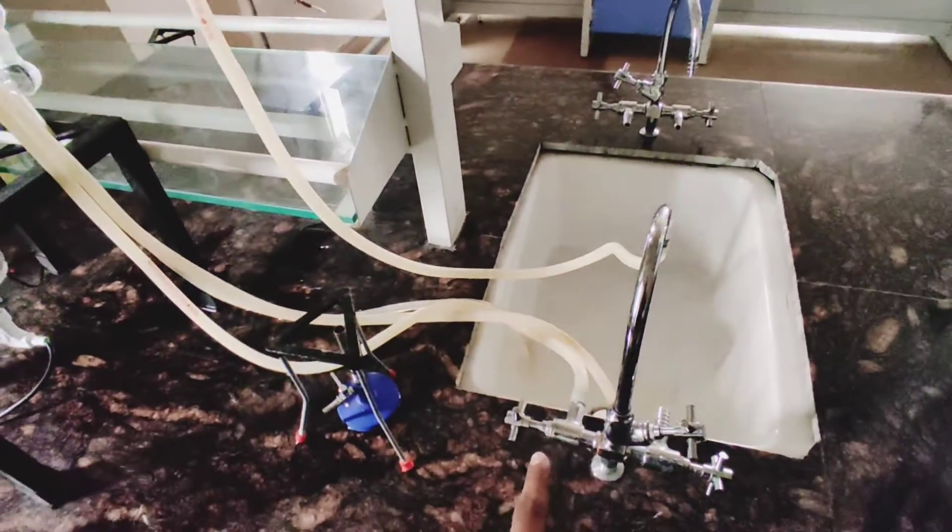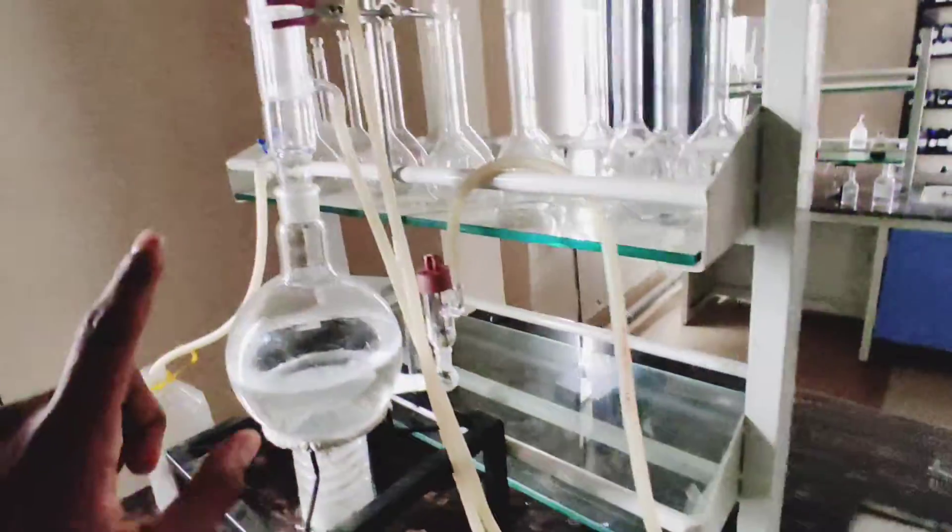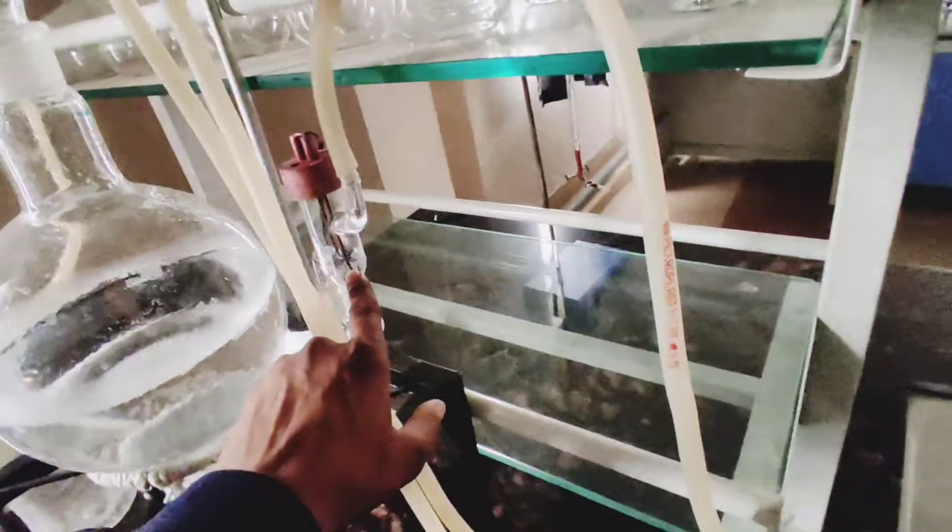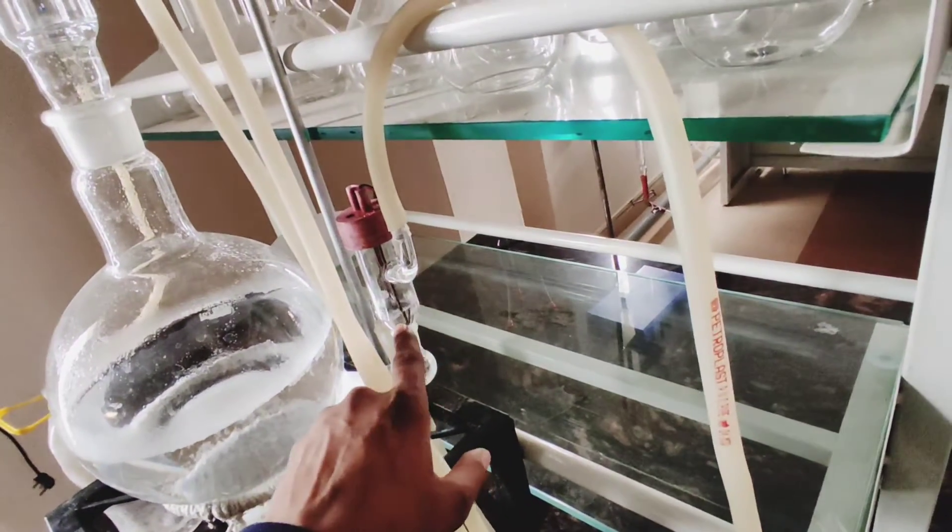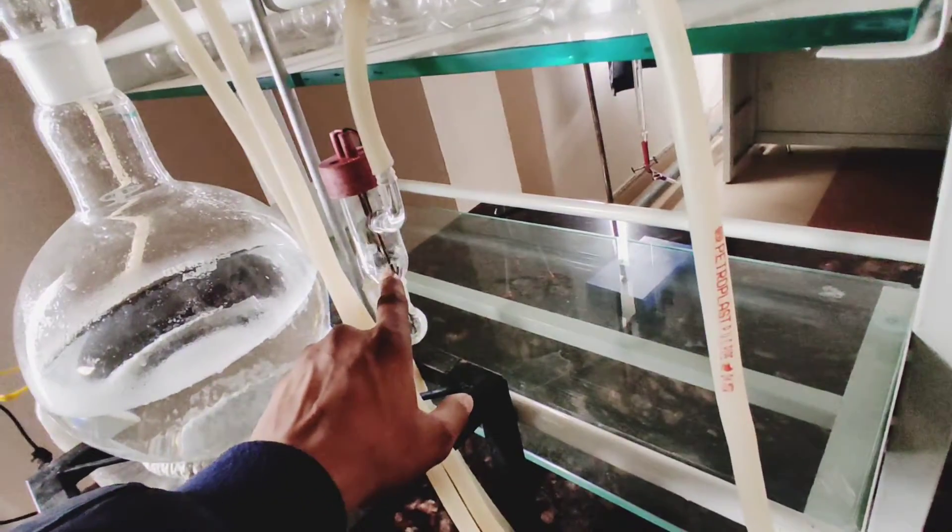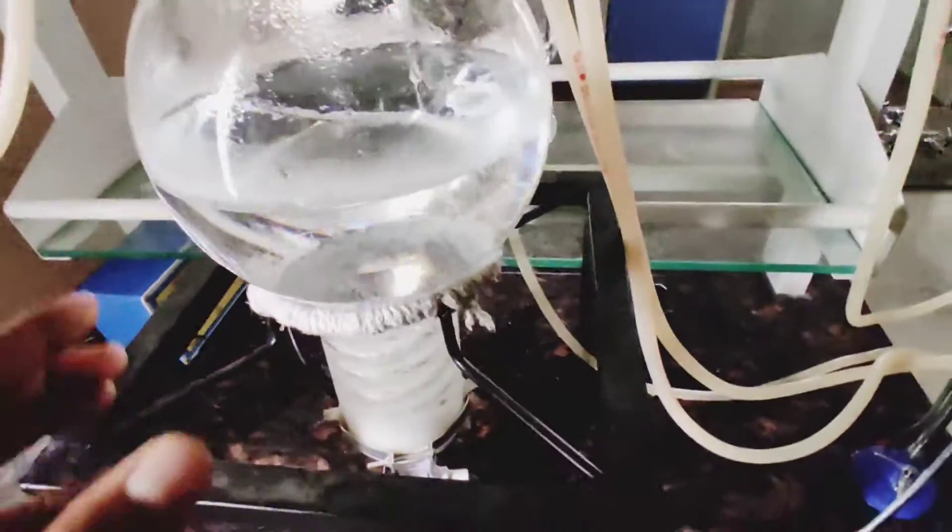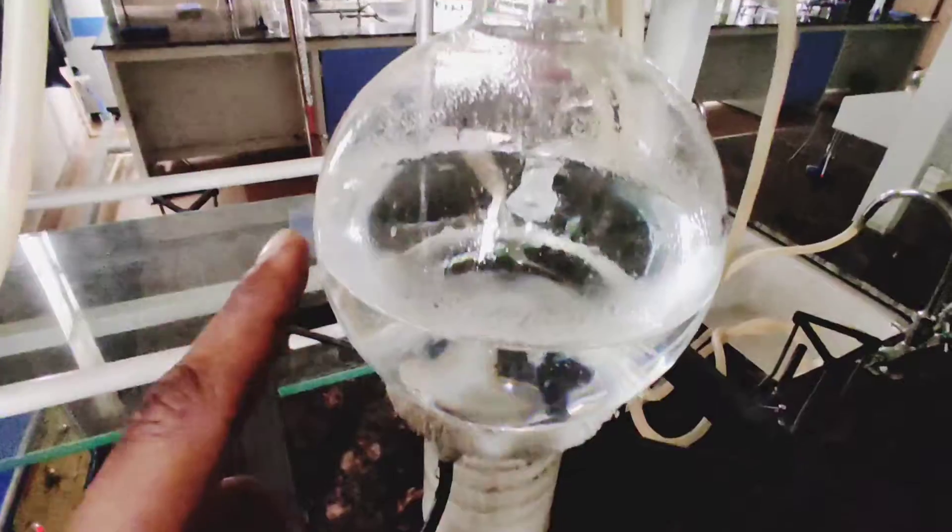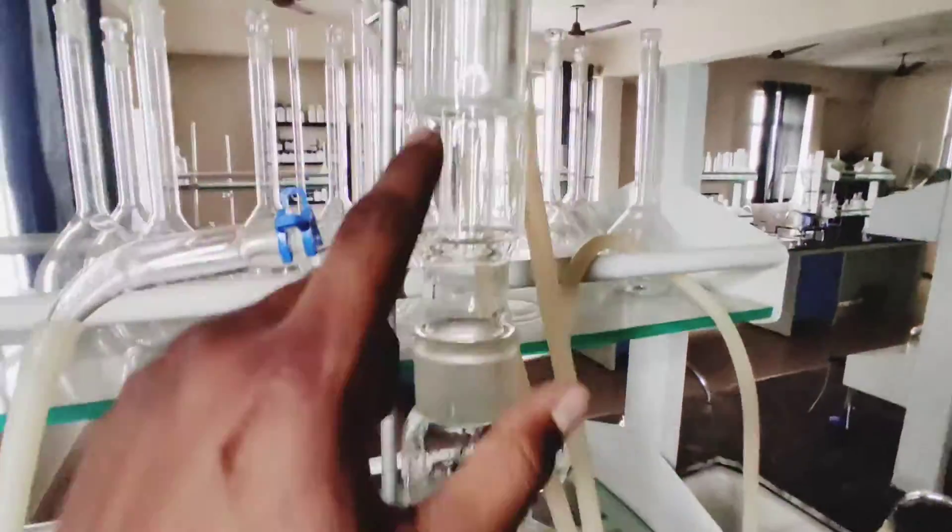So now you are seeing the whole assembly of the distillation process. Here we start the water from here and we put a sensor here. The sensor is activated here. After it activates the water from here, the steam goes up here.